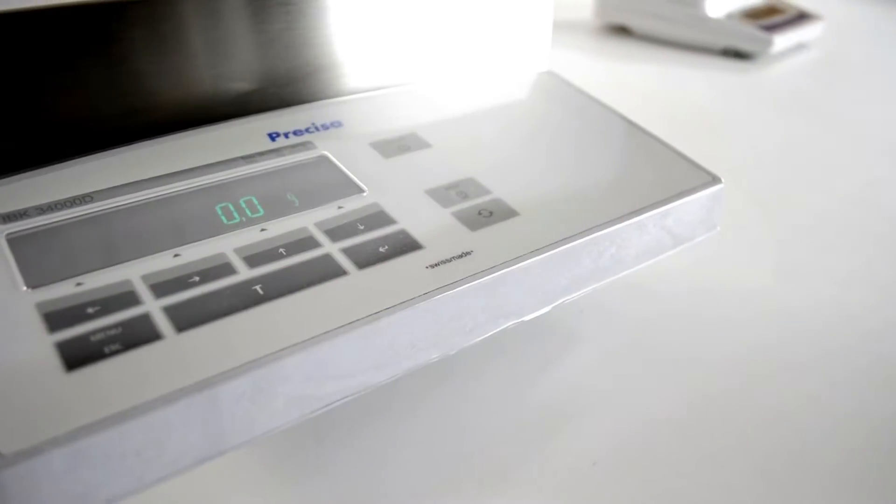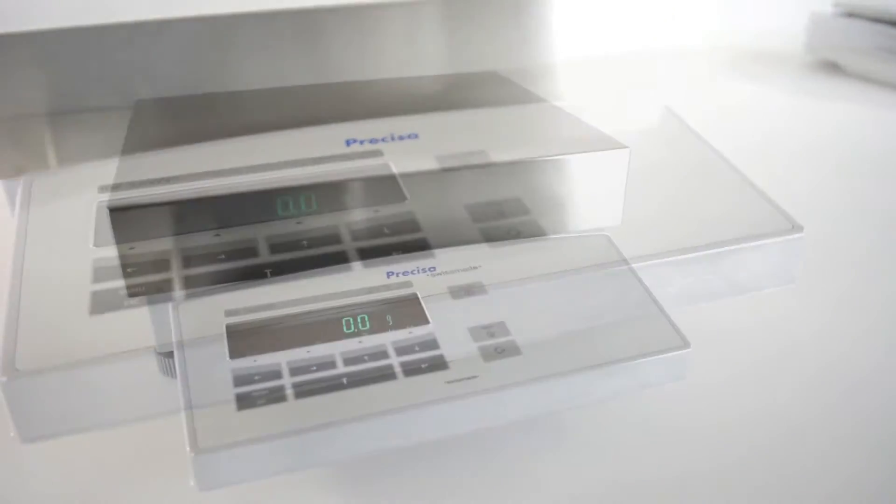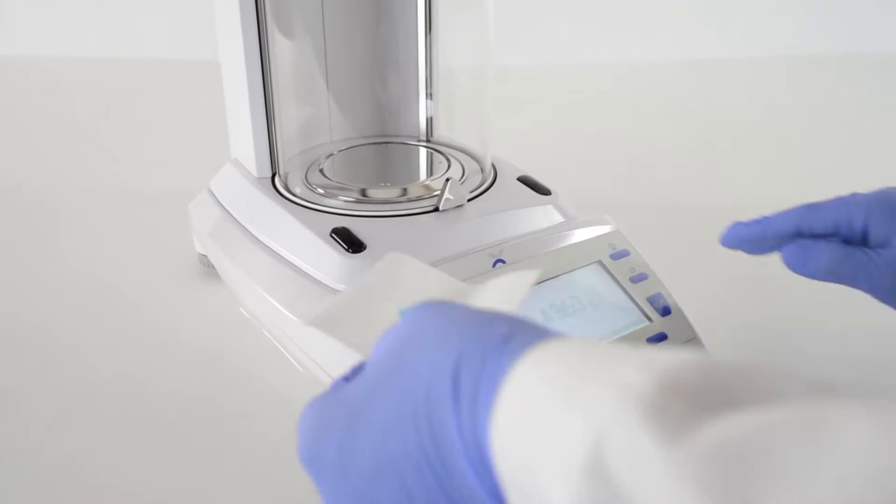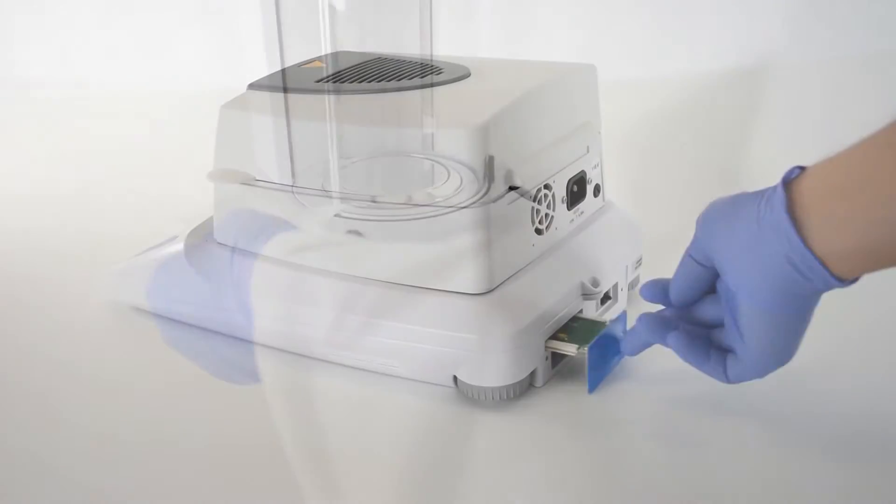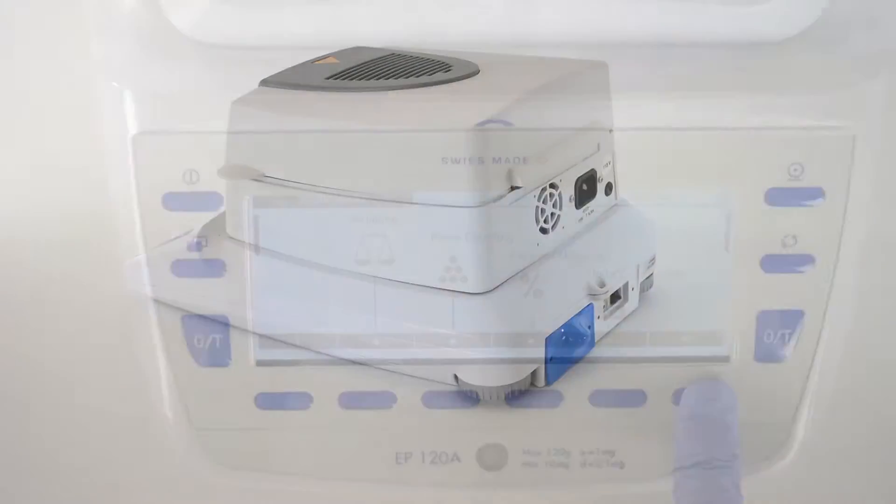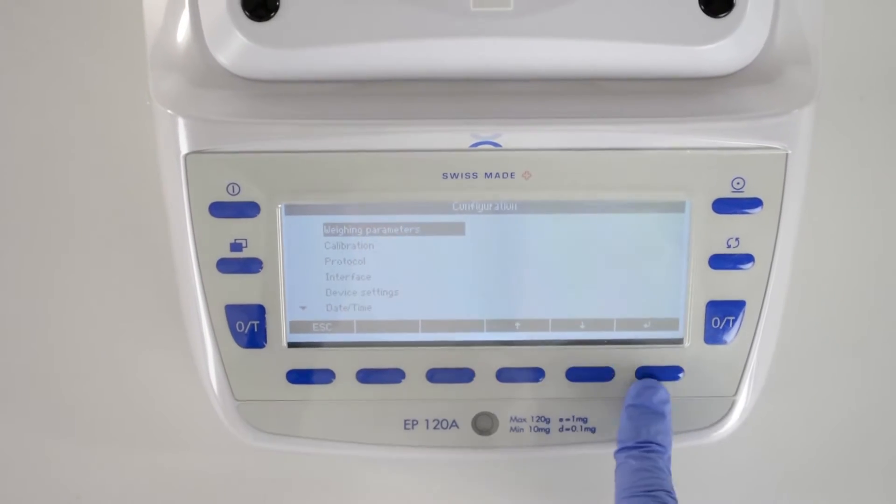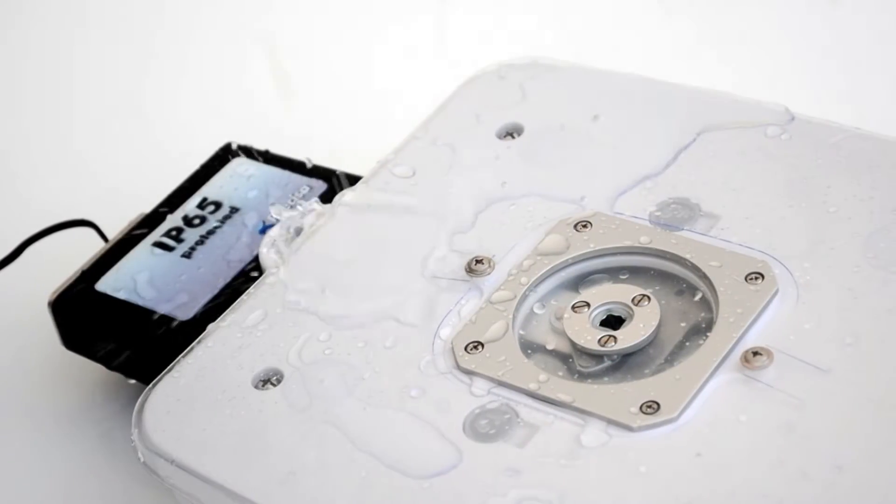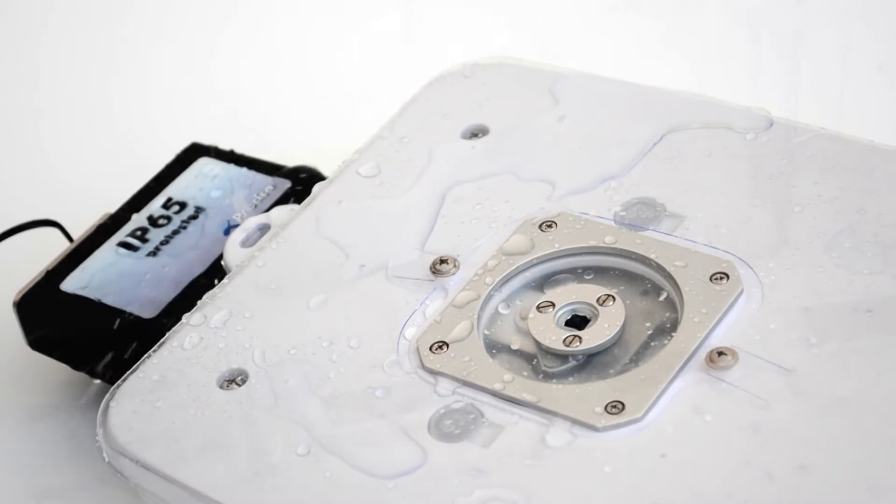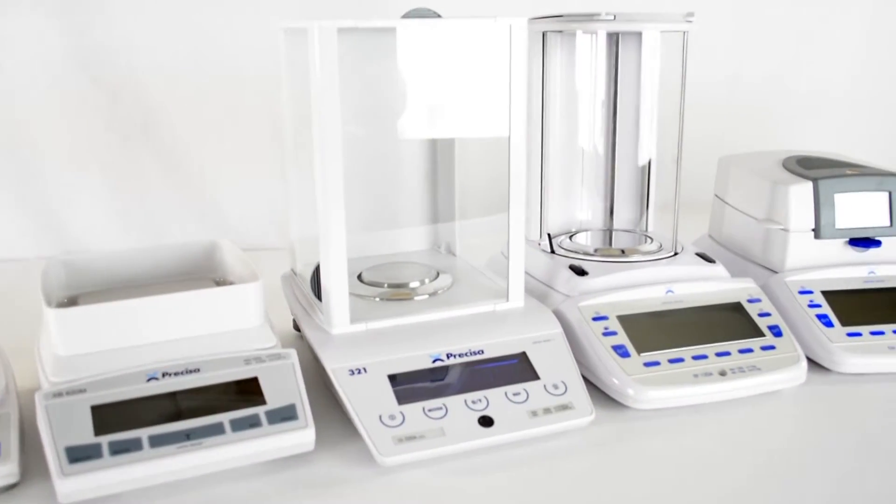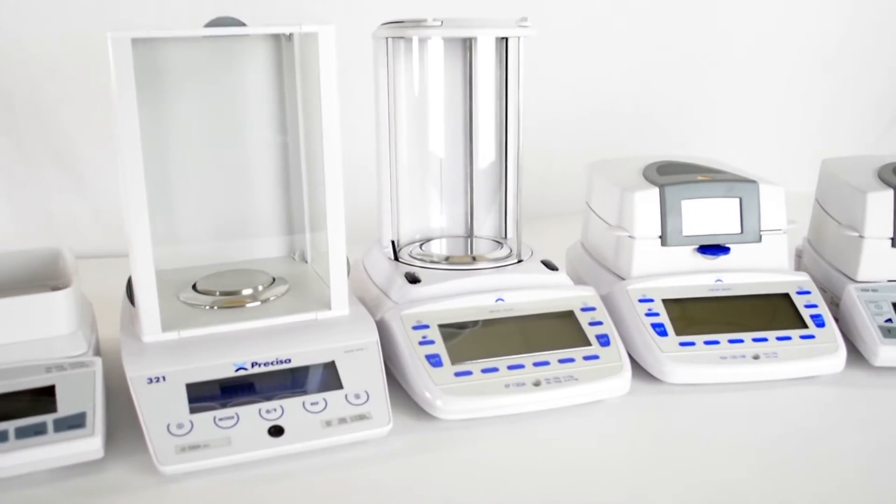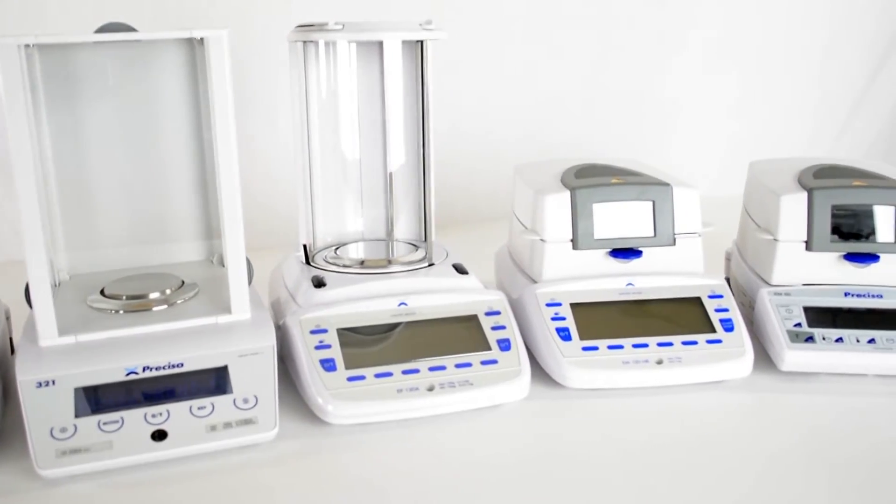The Precisa range features readability from 0.1 grams to semi-micro, with slide-in modules for advanced connectivity, customizable settings, fully serviceable units, and optional IP65 rated housing. The Swiss-engineered Precisa balances are unrivaled in versatility and reliability.